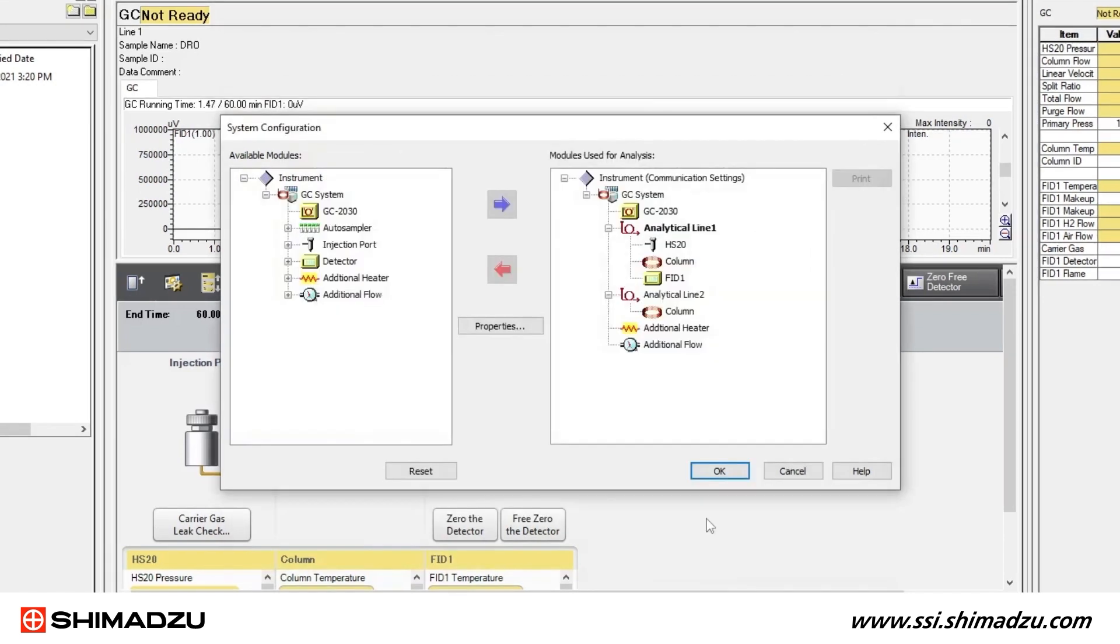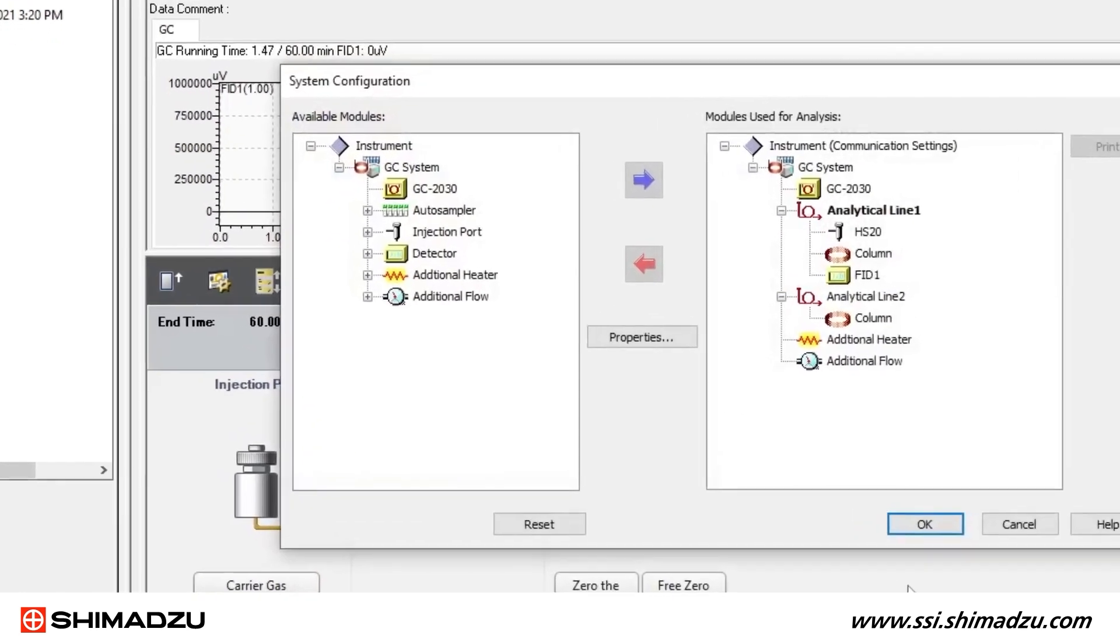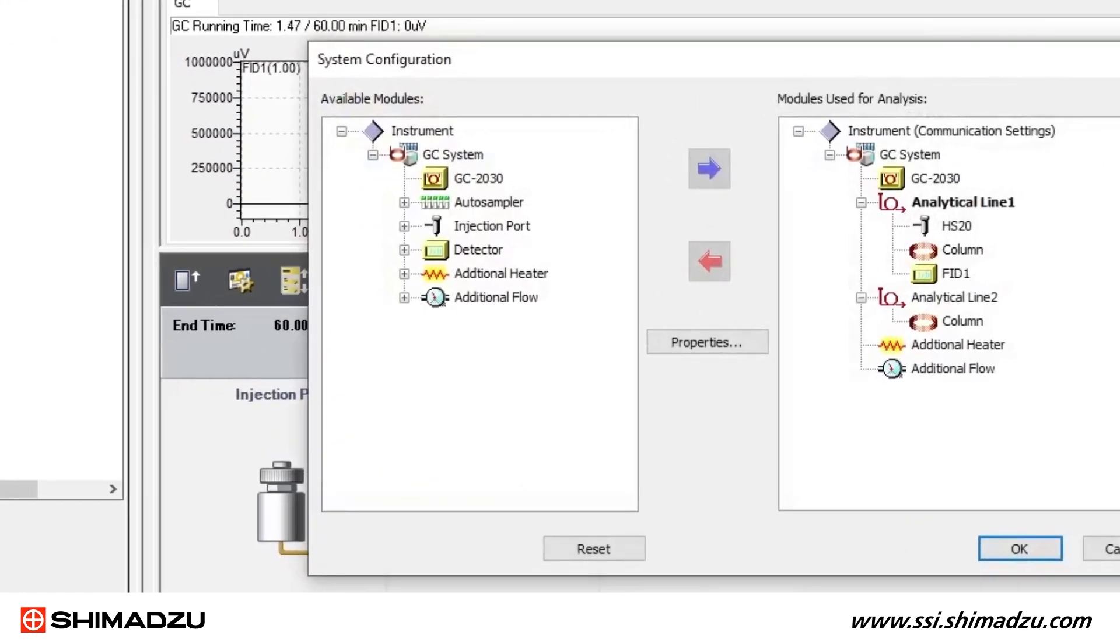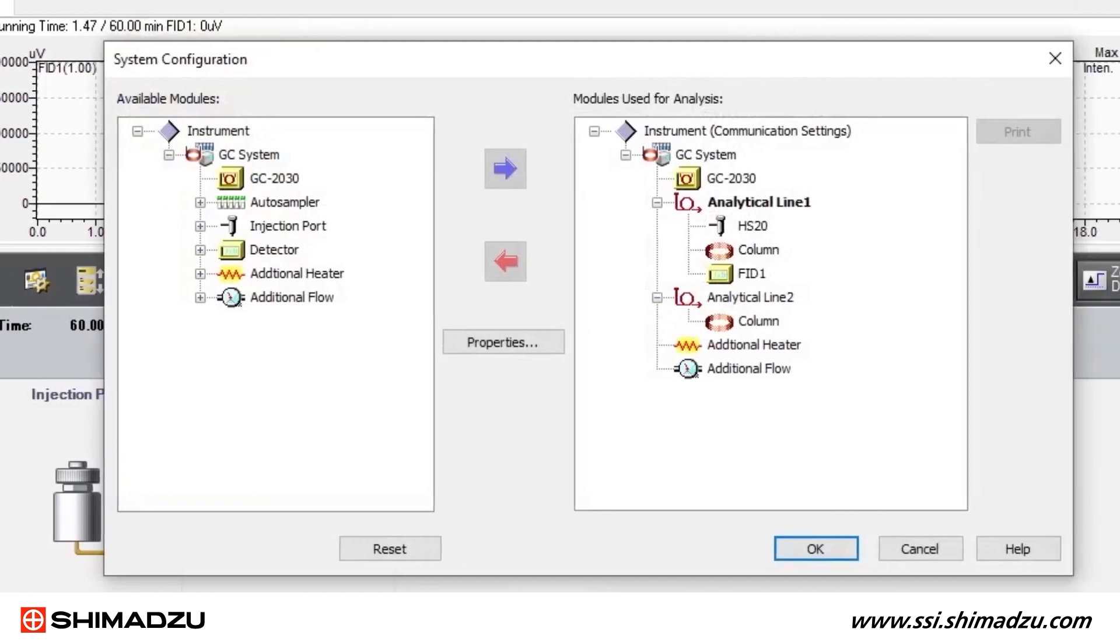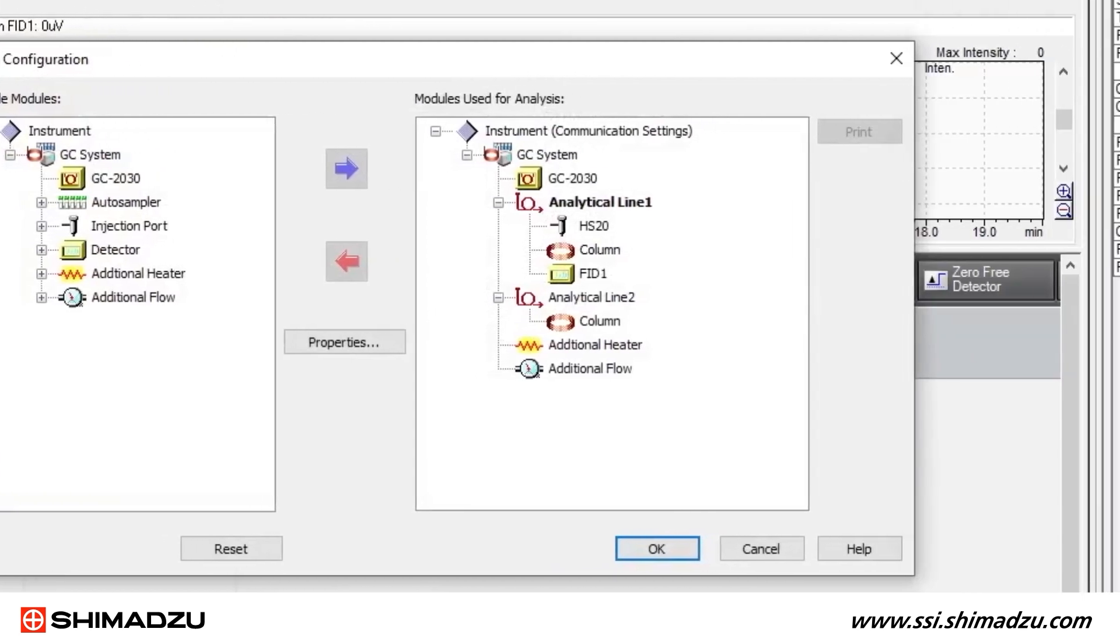You should hear a long beep from the GC when communication has been successfully established with the PC. Now return to the System Configuration window. Available modules are listed on the left side, and modules used for analysis are listed on the right side under Analytical Line 1 or Analytical Line 2.